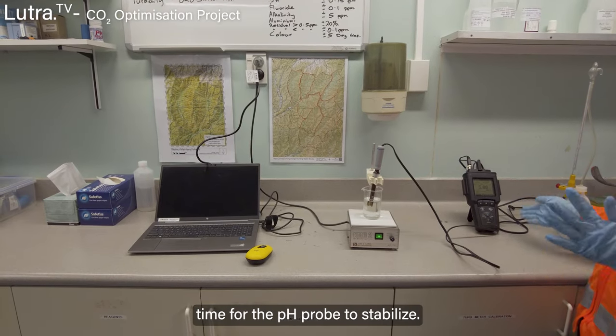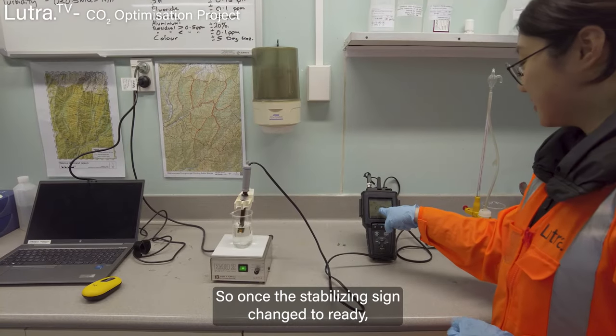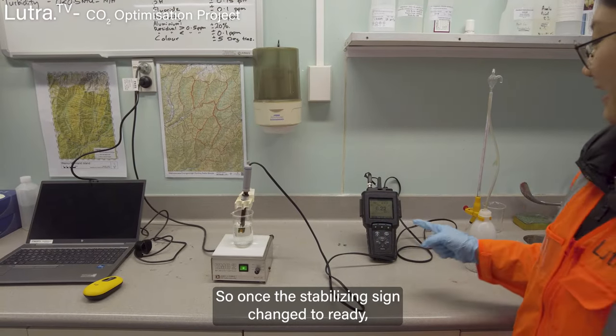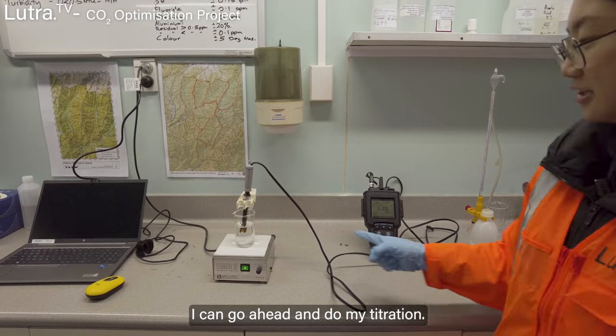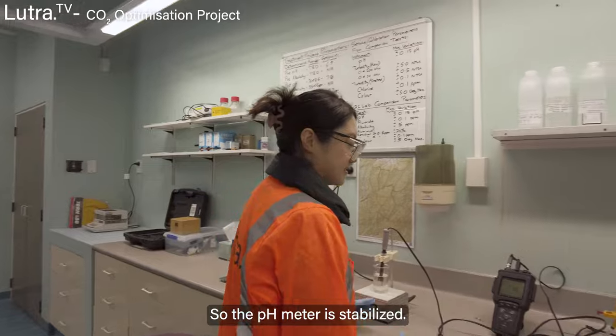It takes a bit of time for the pH probe to stabilize. Once the stabilizing sign changes to ready, I can go ahead and do my titration. The pH meter is now stabilized.